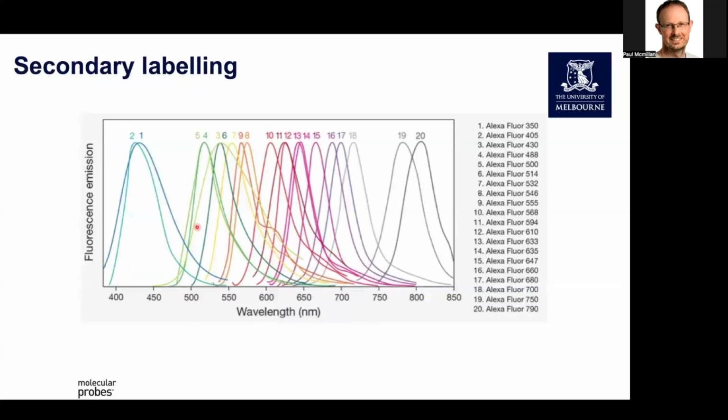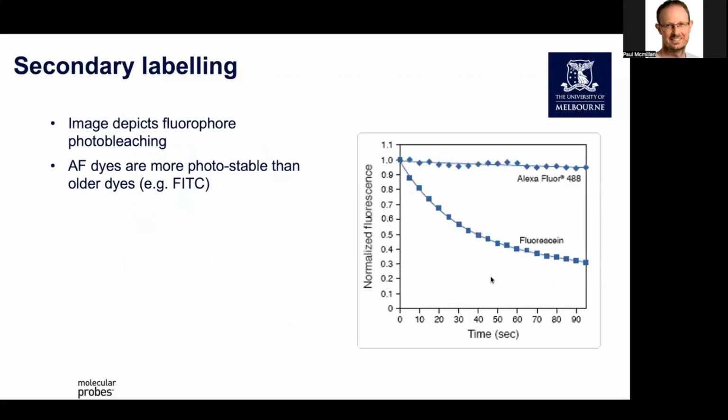The nice thing with the antibody-based approach is we have a full range of fluorophores that are available to us. So we can go all the way from the low 400s all the way up into the 800s, 850s, probably now pushing into kind of 900 nanometer wavelengths, that allows us to do lots of different multiplex imaging if we want to.